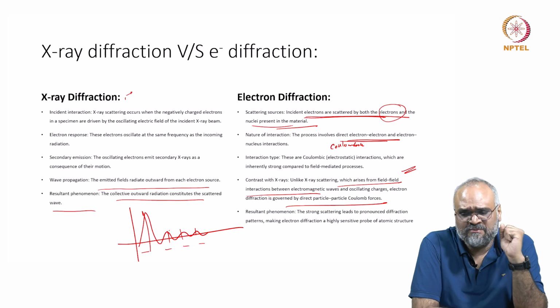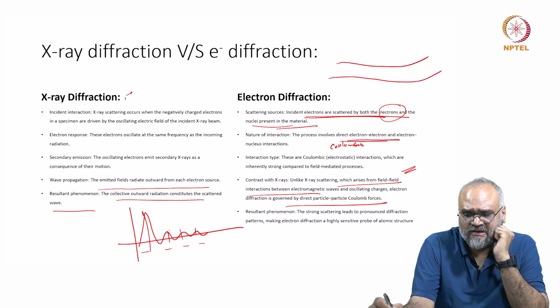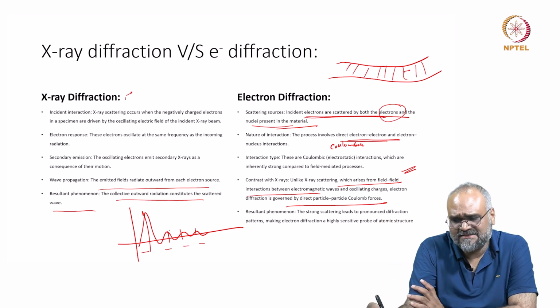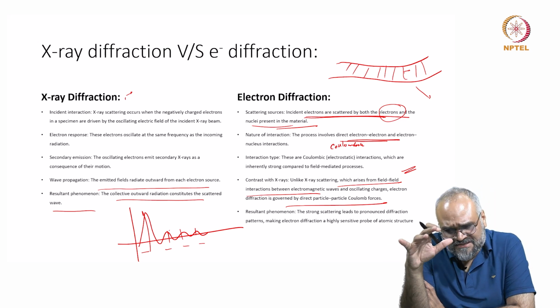And also remember, the specimen, as I was mentioning to you, can have slight bends within it, and can also have small misorientations of the internal atomic planes, and even these small deviations can give you a variation in the diffraction patterns as well.